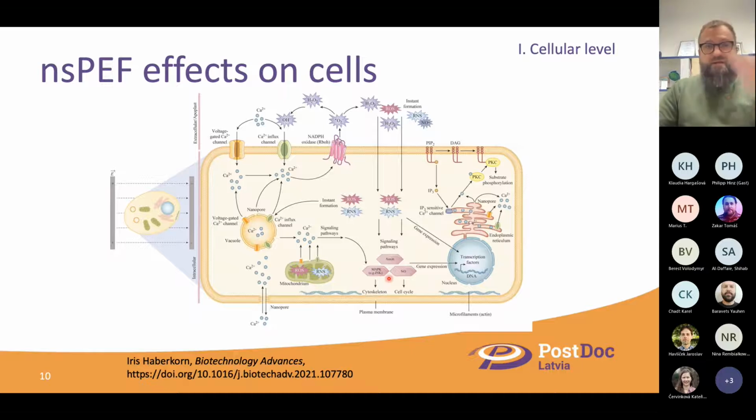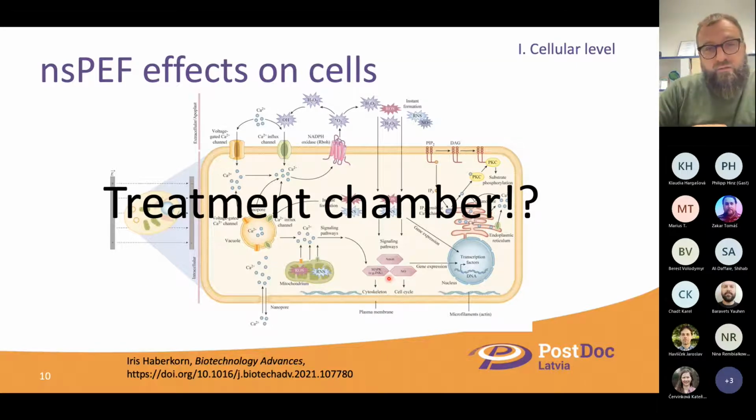And of course, as you can see from this drawing, there are still a lot of questions, and a lot of factors and other compounds can be generated after such nanosecond pulsed electric field treatment. But we believe that it could be a more precise way to treat the cells and to trigger some intracellular signals. But the main problem here is that if we want to start dealing with such treatment with nanosecond electrical pulses, we need specific treatment chambers.